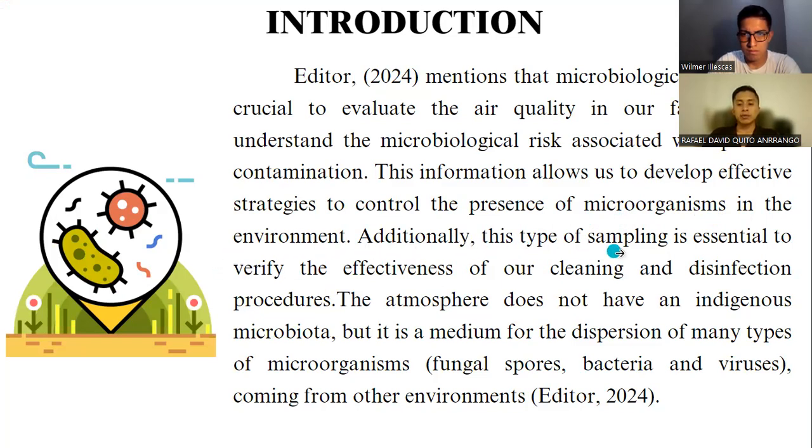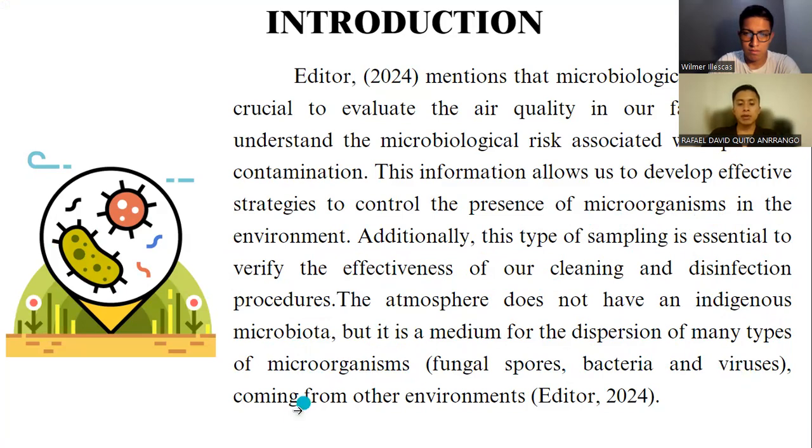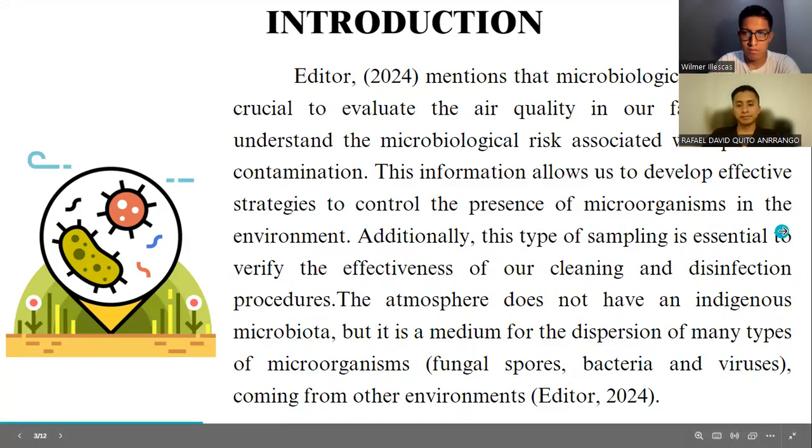Additionally, this type of sampling is essential to verify the effectiveness of our cleaning and disinfection procedures. The atmosphere does not have an indigenous microbiota, but it is a medium for the dispersion of many types of microorganisms, fungal spores, bacteria, and viruses coming from other environments.